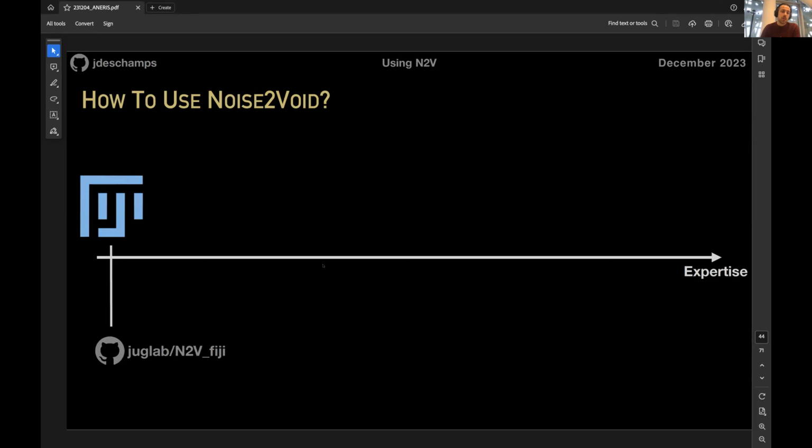You might have some problems in the setup to get GPU training or even to get it to run. We have good hopes with current work at the Pasteur Institute, Madrid and Wisconsin, from the people behind Fiji maintainers, to be able to retrain this type of network soon in Fiji and ImageJ. But currently, we're not really advising this.